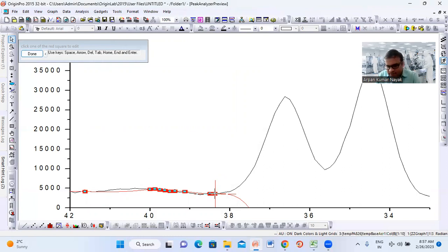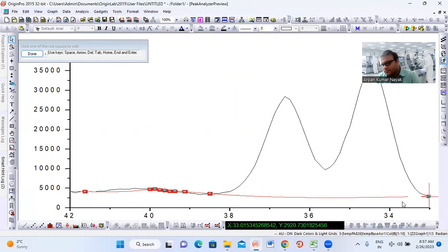So what I will do here, you can see now one point I took. You can move a point, just click the point and bring it. So I took it here. Then one more point. Since I took 10 points, I will do it accordingly so that the complete line will get. You can see it was going up, but we don't want up. Yes, now it was coming closer. So now you can see it is even closer. So I can do it here this way.